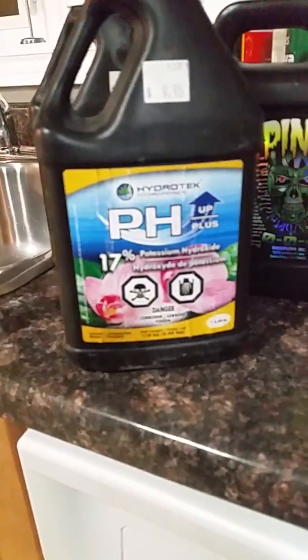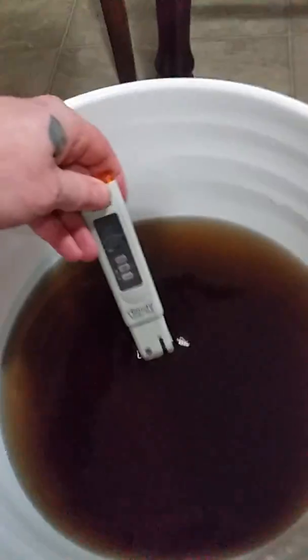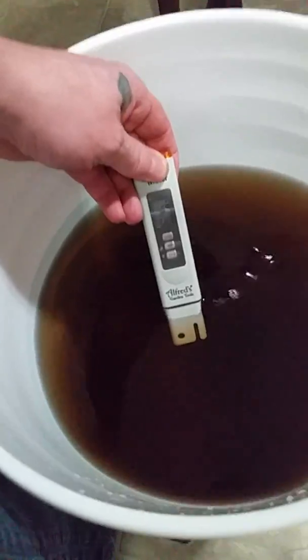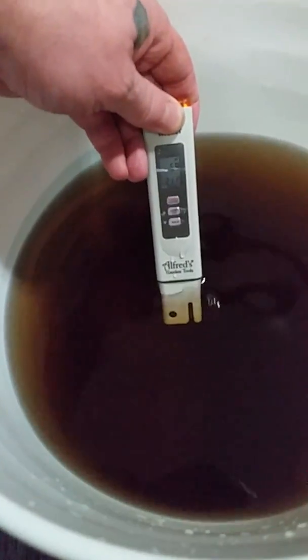So don't go screwing around too much with it. It's 17% potassium, so be careful — use it in flour as well. Now we're going to check our pen and it's showing us here now at 5.9.